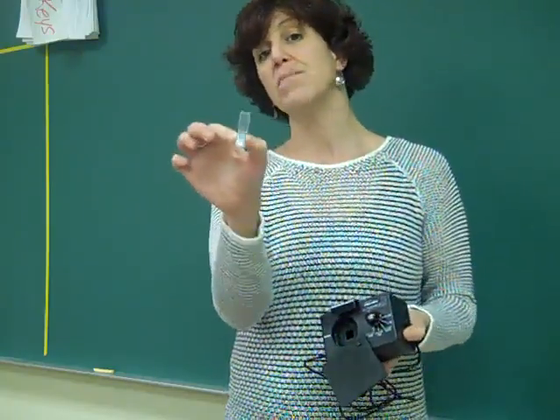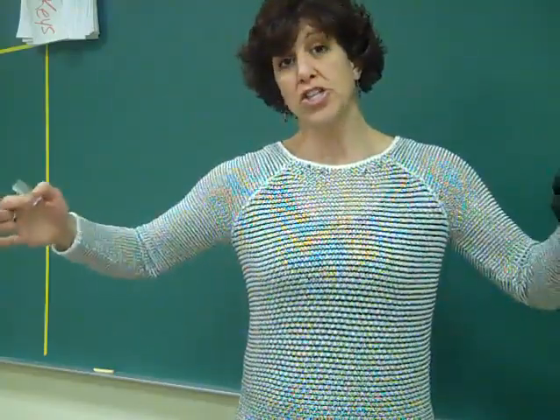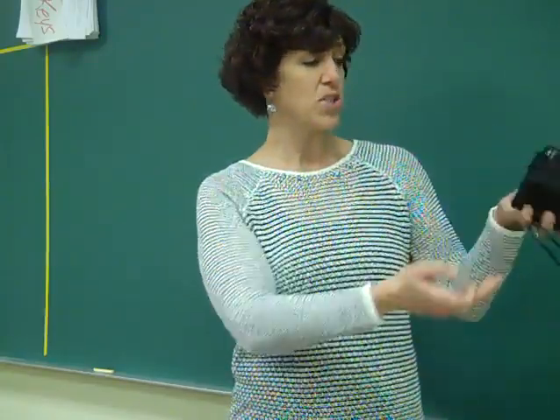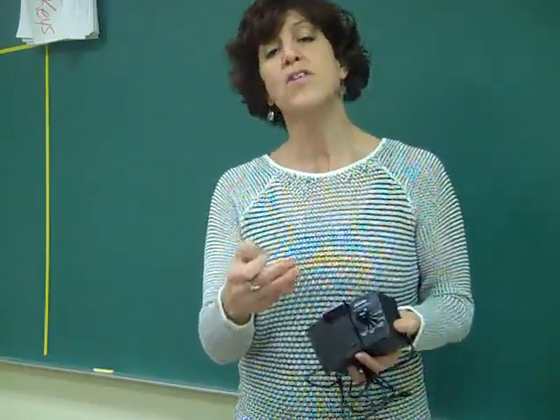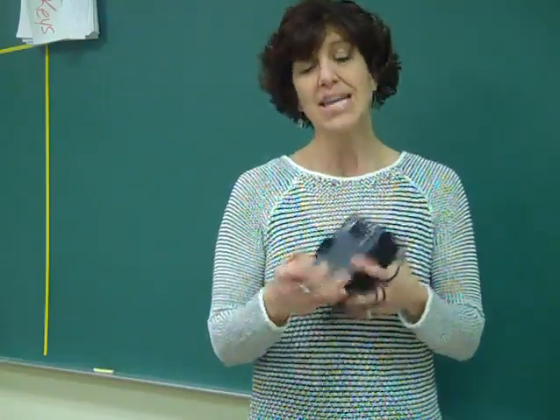And again, we want to measure the rate of photosynthesis. But this time, I have a very large spectrophotometer, or we have these small specs which are called colorimeters. Both of them do the same thing. They can measure either the absorbance of light, so how much is being absorbed by it, or the transmittance, how much is going through. And instead of NADP+, we're going to replace that with a blue dye called DPIP.